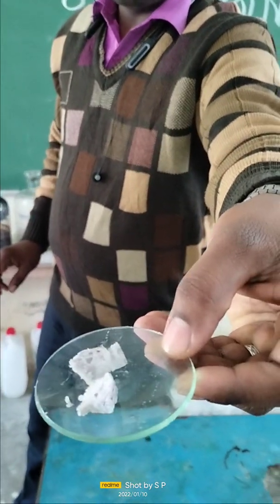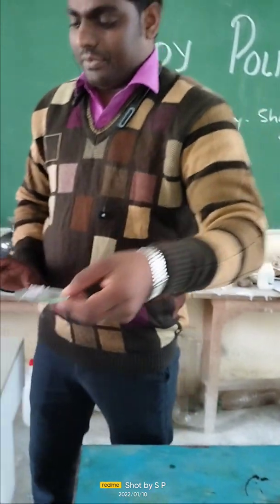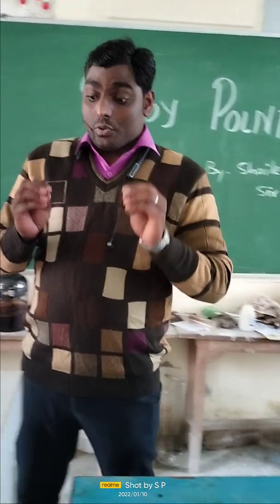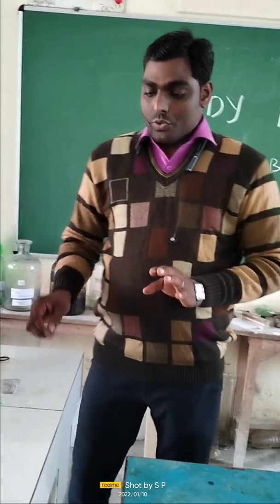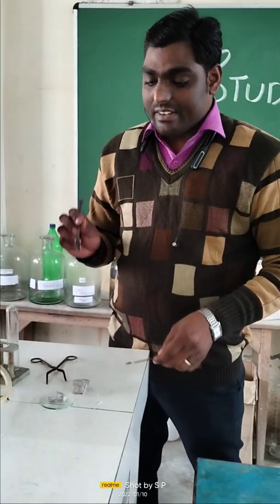See how its shining surface appears and how it is cut with the help of a knife. Because it is a soft metal, we can cut it easily. It is a very highly reactive metal — do not try to touch it with your hand. If you touch it with a wet hand, it may burn your hand. So it should be used with a lot of precautions.